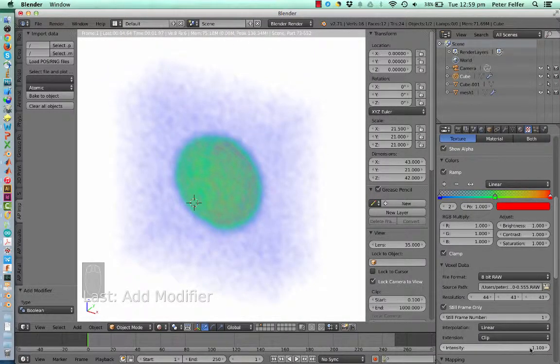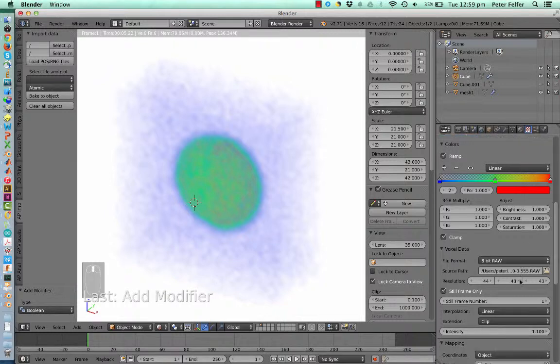1.1. See, we're still getting some color artifacts. It's simply because of the step size. I'll crank the step size up in a little bit, just so that you can see. But yeah, that's already some nice rendering. And we would want to change the... Oh, sorry, that's the wrong one. We would change the interpolation as well.